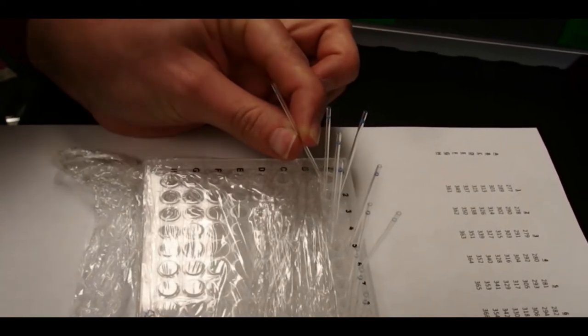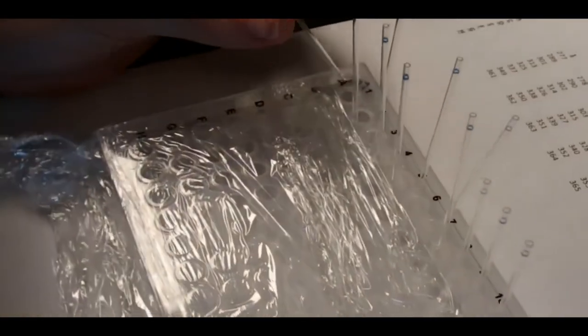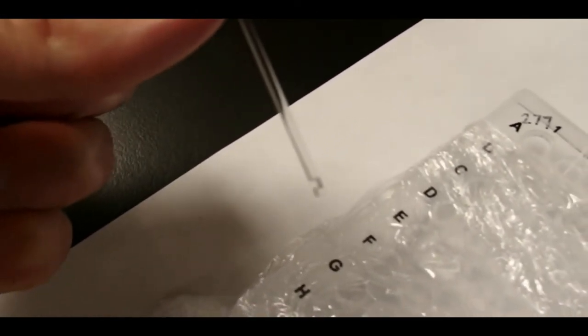And so to do this, did it go? Mm-hmm. All right, let's see here. Let's see the capillary tube first of all. If we look at the capillary tube now, if we can get a focus, there's no leaf disc in there. That's going to be your best sign that the disc is gone. And the plate, we'll see if we can. You can see a little green thing in that well there.